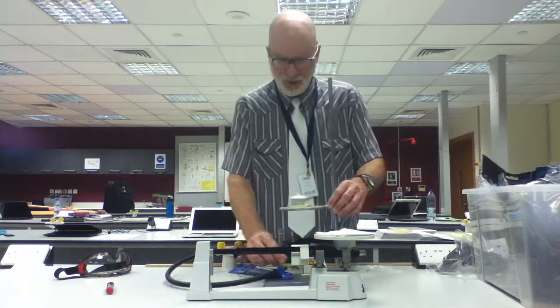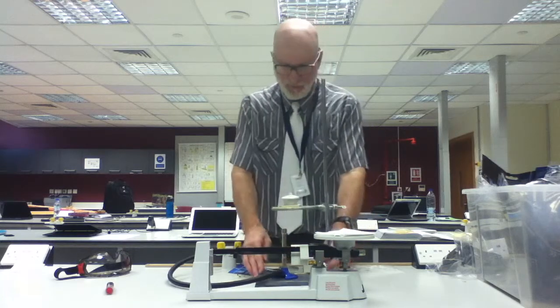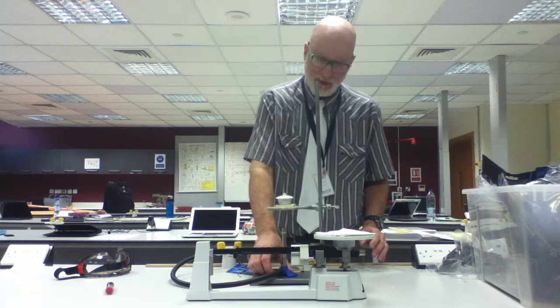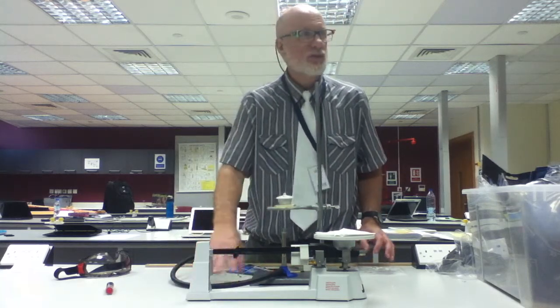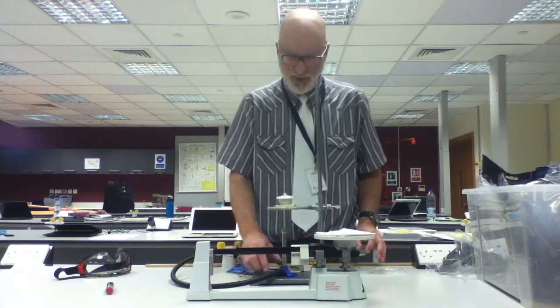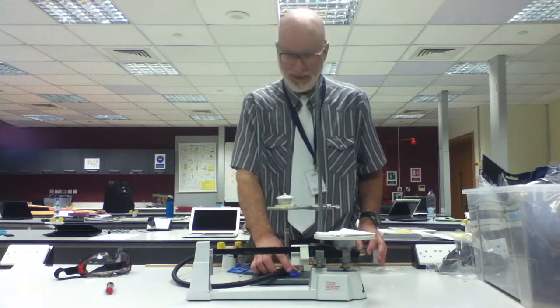Put on your fire. Make sure the Bunsen burner is stable, because this tubing is very rigid, so you want to make sure it's not moving. Okay, everything is nice and stable.